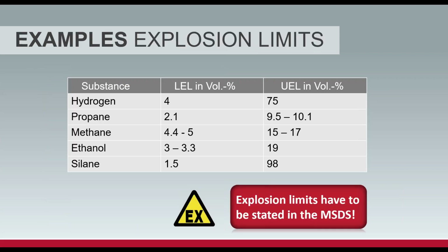The problem with chemicals in flammable cabinets is everybody looks at those and says, ooh, that's the stinky cabinet. Well, the problem behind that is the exposure level and chemicals that are in that are just absolutely bad for people, right? The exposure limit for people is 10 to 1,000 times less than the LEL. So if we get to a LEL, those people have been exposed to those chemicals forever. So vent your cabinets, vent your rooms, get the right air changes.